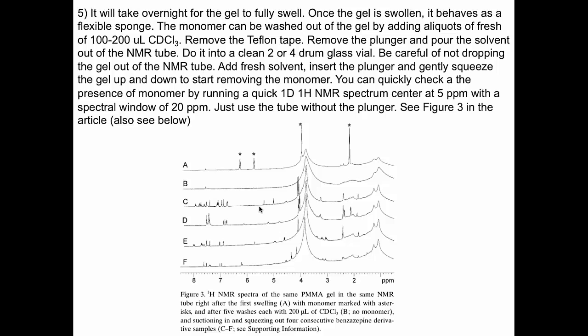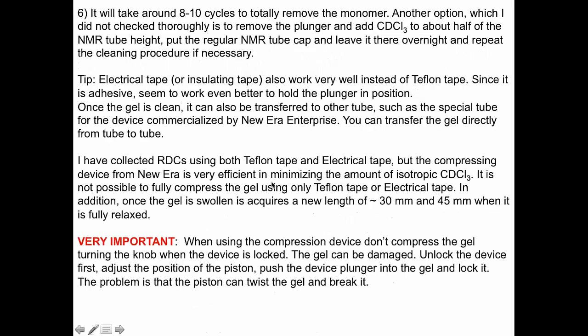And then again, you put the sample in, and you gently pump with the gel, and then the solution will equilibrate, and you will see your sample inside the gel. This method, well, sometimes it took 8 to 10 cycles to clean the monomer.